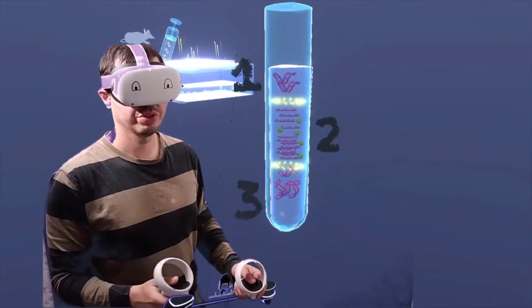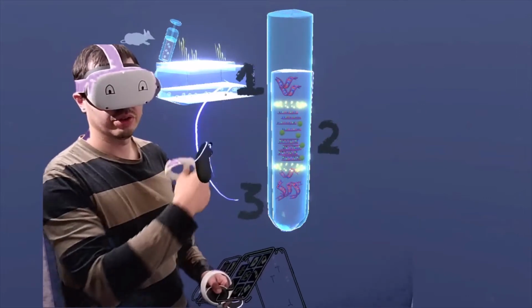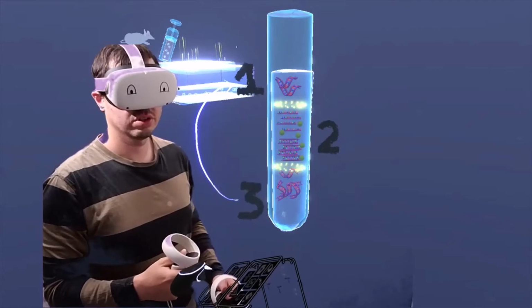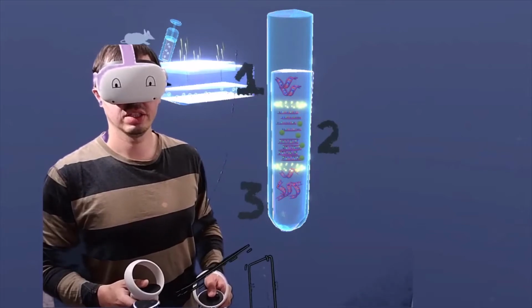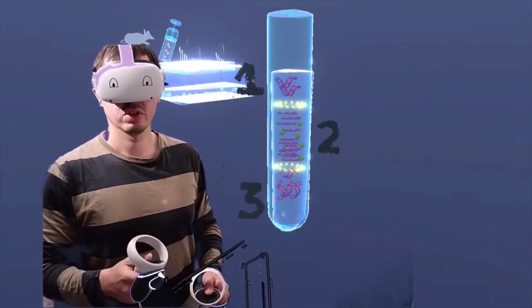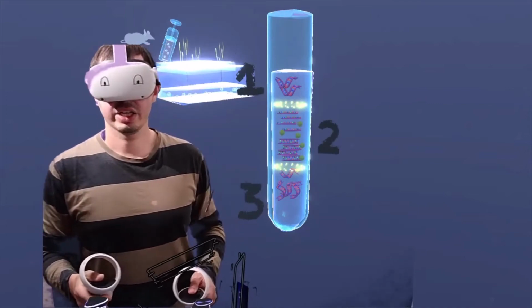So what you want to do is to go all the way through the steps again, do another round in order to increase the genetic material. This genetic material you're going to need to understand what your protein actually is, to understand what it's made of. DNA encodes proteins.